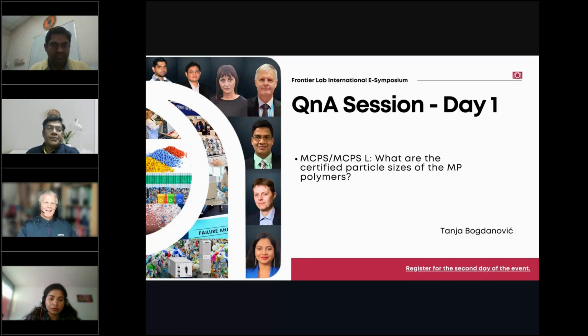Good question. Unfortunately, I don't have the data ahead of me, but I can tell you that in the microplastic calibration kit, we have the polymers diluted in an inorganic diluent like calcium carbonate and quartz. And I think the quartz powder is 30 micron particle size. When we prepare this kit, only PE and PP are used as solid polymers, so that means this must be ground into very small particles. But I don't have the particle size in mind right now. I can ask for that.